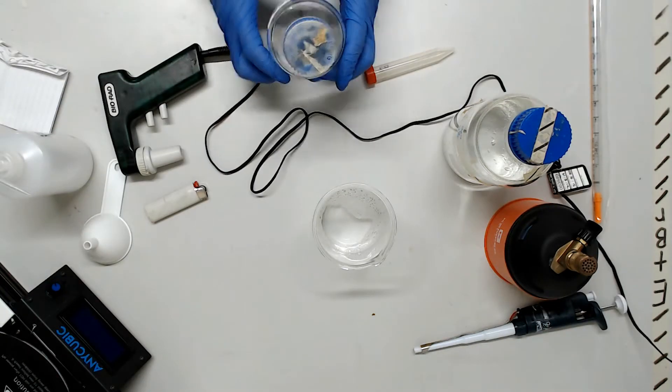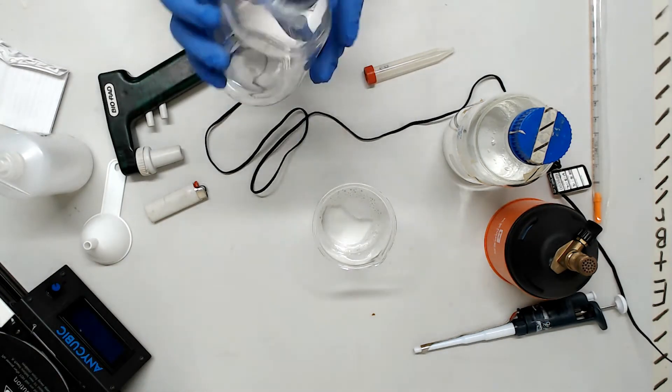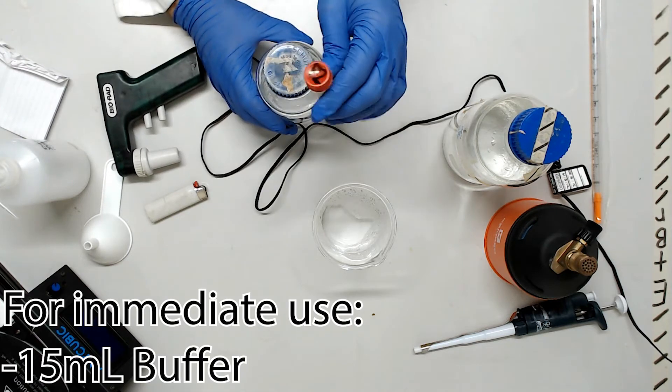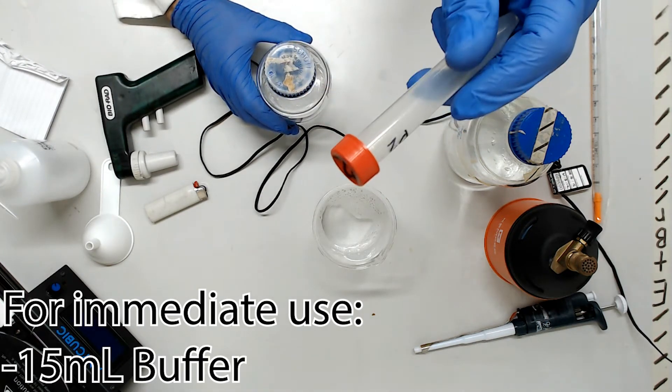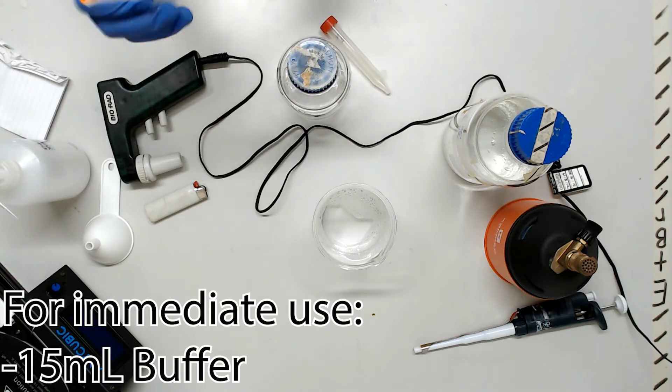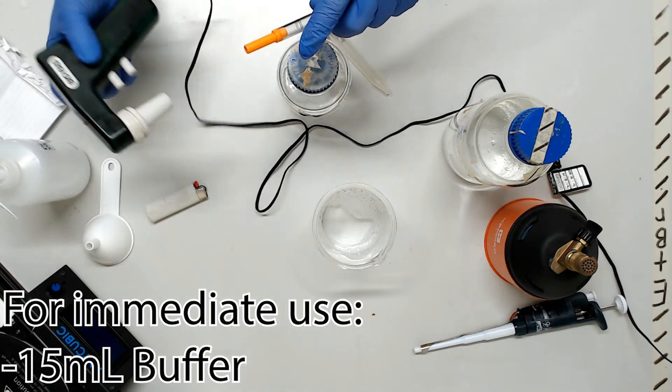Let the bubbles subside, then gently pour your fresh solution into a sterile bottle, not forgetting to add 15 mils to a labeled falcon tube for immediate use. The falcon can remain at room temp, but keep your stock solution bottle in the fridge.